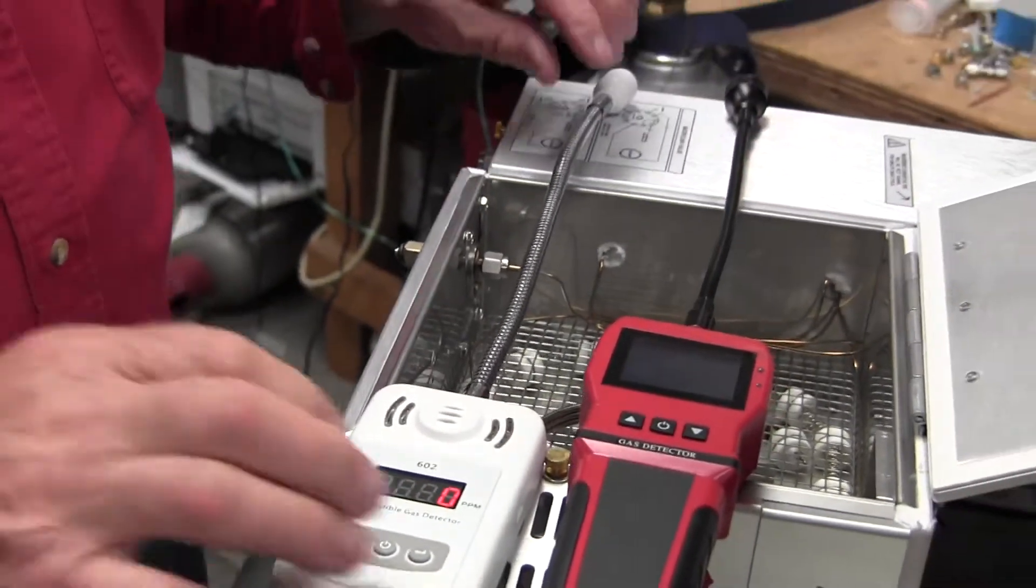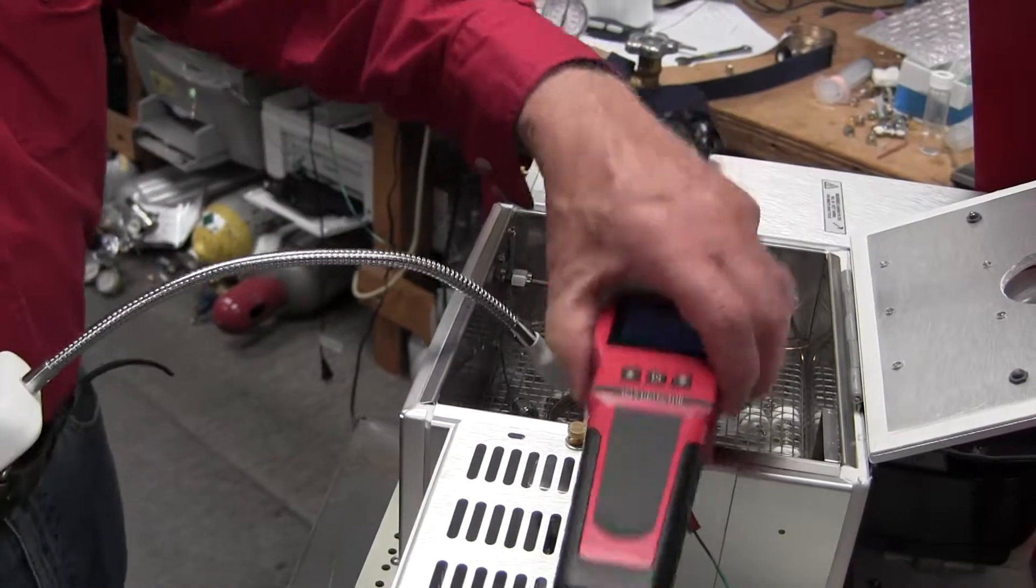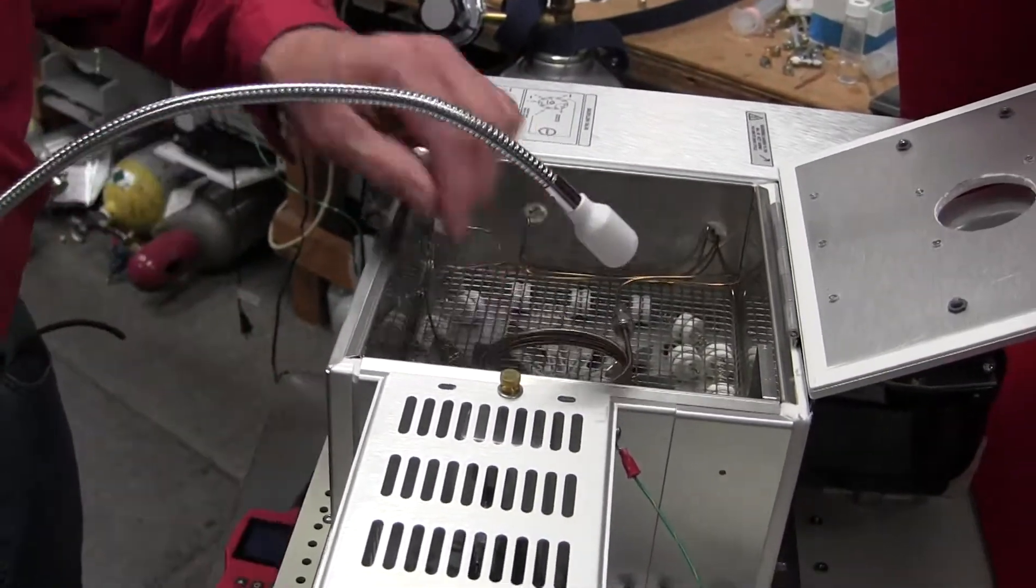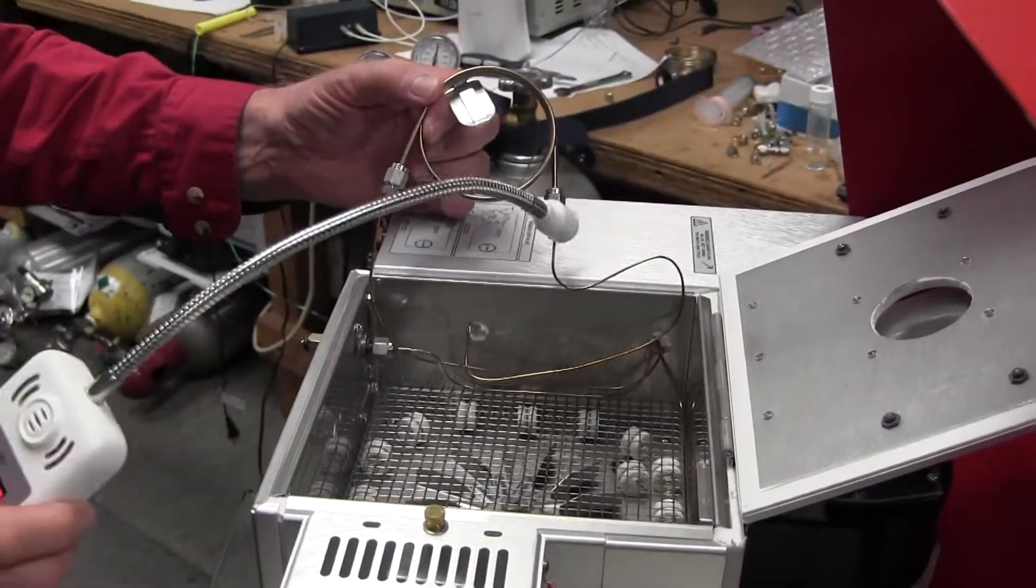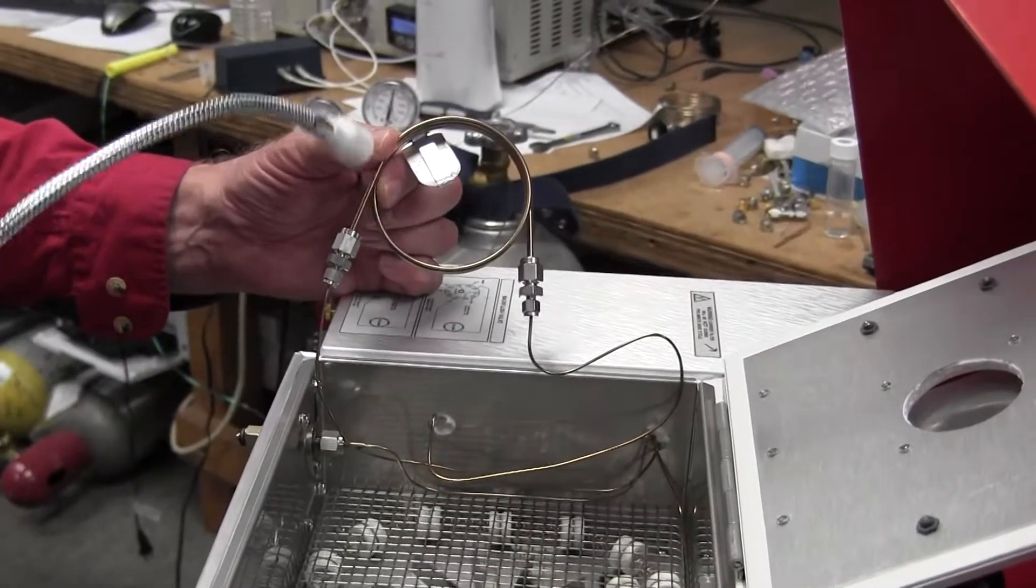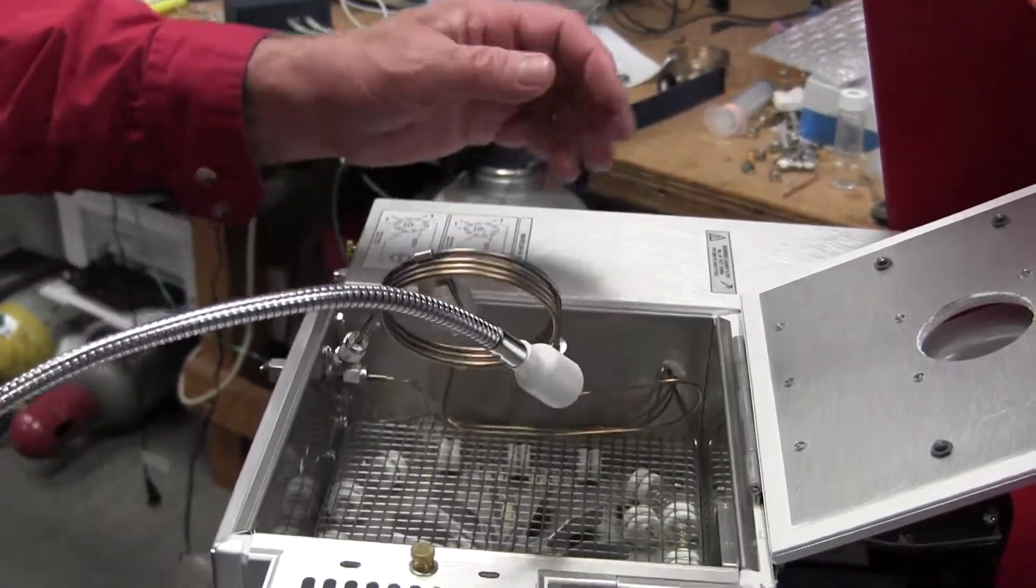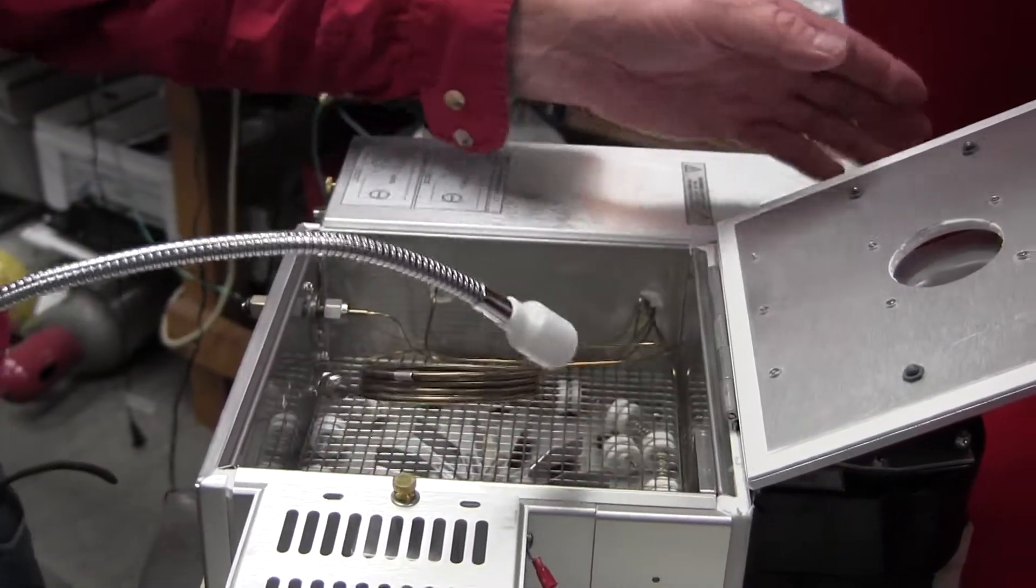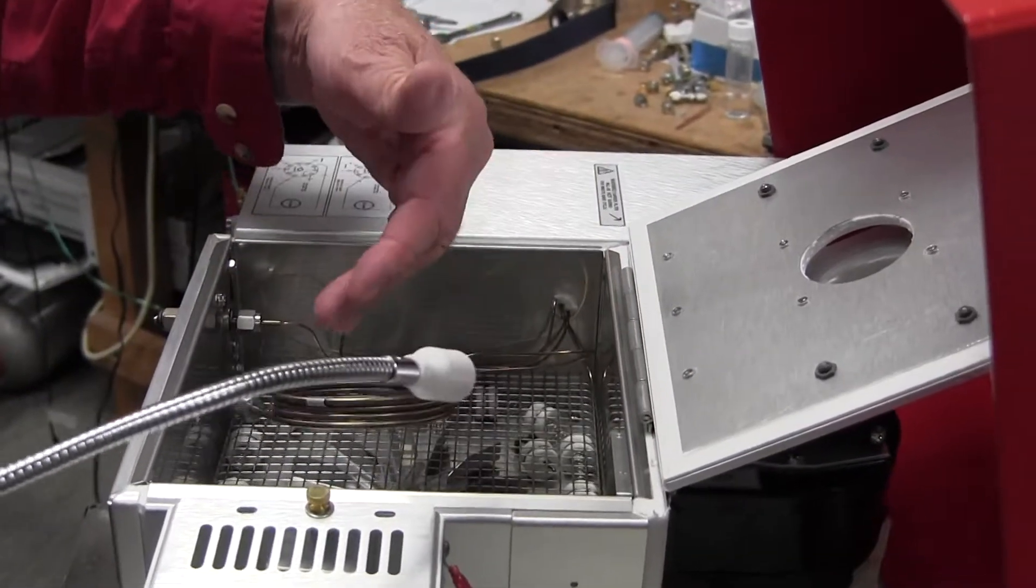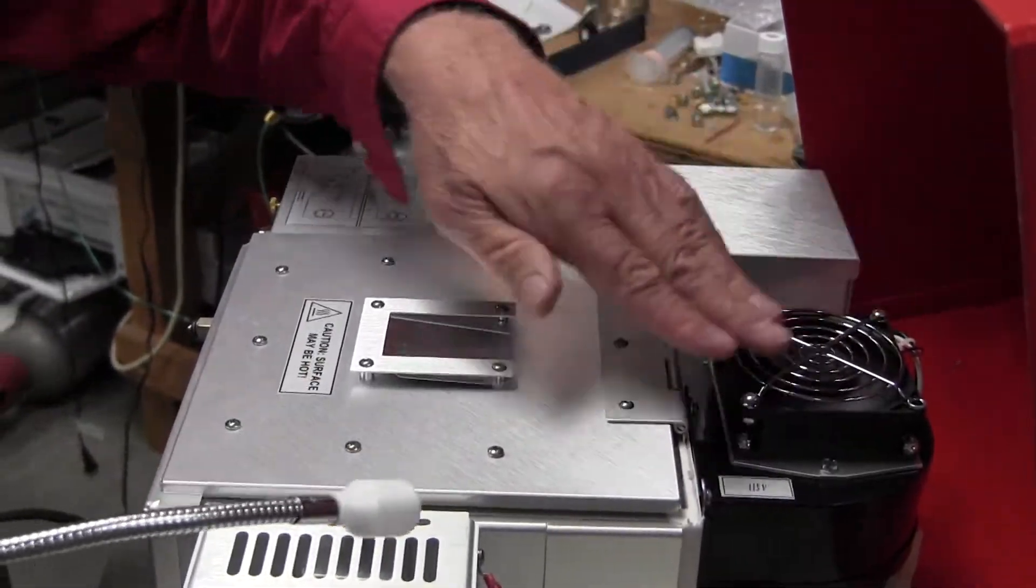There's one other trick that we like, because a lot of times the leaks are going to be in the connections between the column and the tubing, or between column and column, or something in the column oven. When the GC is on, there's air blowing into the column oven from this cooling fan here.